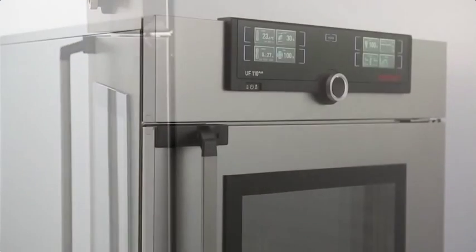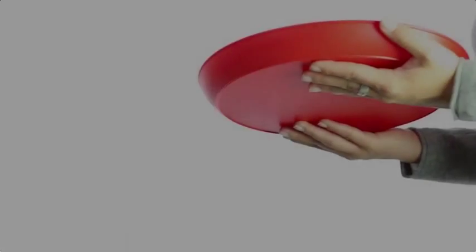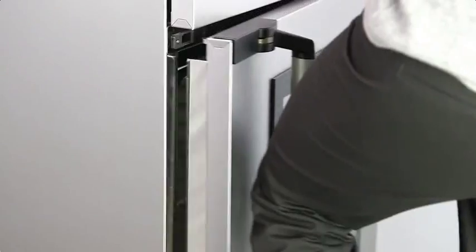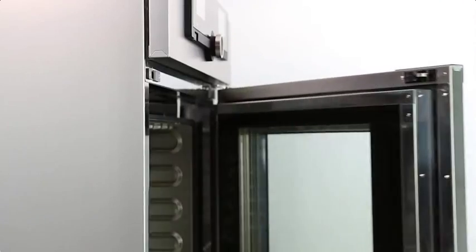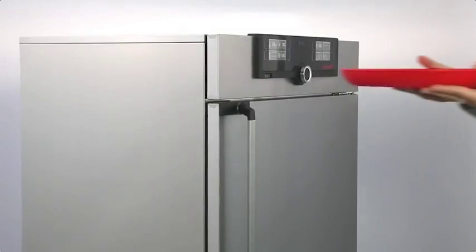Your samples appreciate a relaxed atmosphere in the lab — what about you? Even when your hands aren't free, the Generation 2012 appliances can now be easily opened and closed using the knee or the elbow. And to keep the atmosphere relaxed for your samples inside, this is of course done almost without vibration.